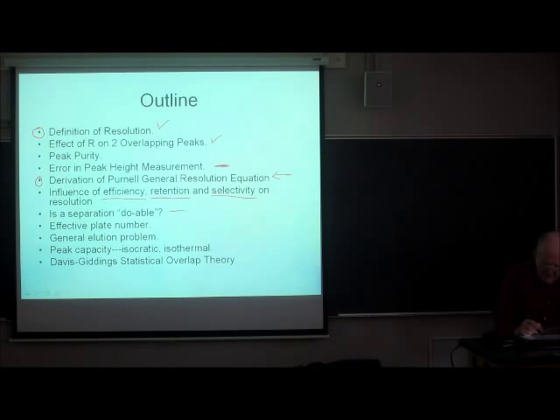Then we'll look at a very, very fundamental issue. Is the problem doable? You may be in a situation where it is impossible or exceedingly difficult to do the separation. And you want to know when you're facing that, because you could beat your head against the wall and never get an answer. Well, we'll delve into an interesting concept called the effective plate number, which its meaning will become apparent when we get to it. And I don't know that we're going to get to the general elution problem today, but that's just too far down the list. But these are the main things we're going to talk about today.